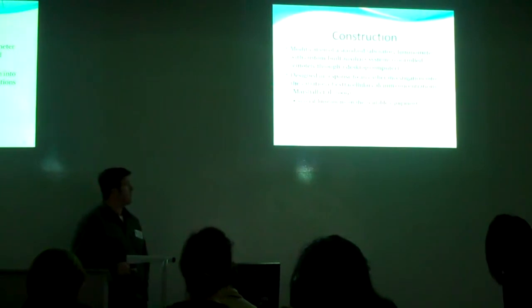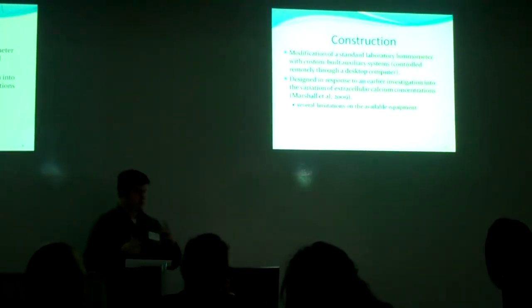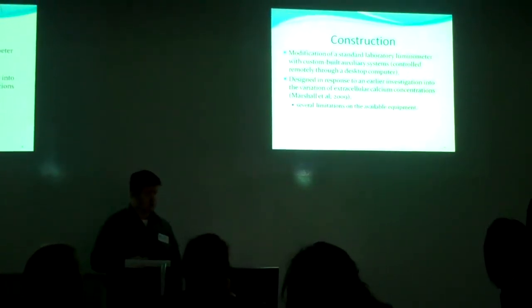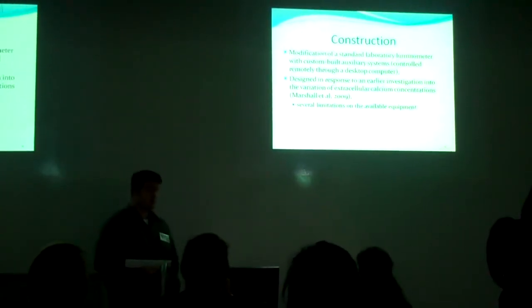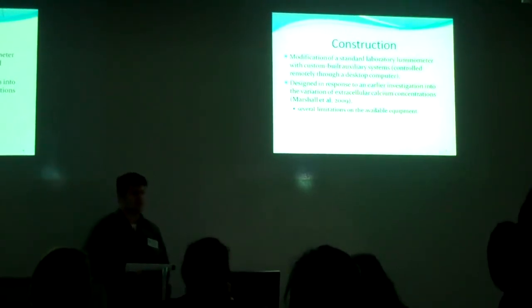out. The construction involved taking a standard laboratory luminometer and changing it with custom auxiliary systems, such as the pumping system, which we control remotely through a desktop computer. It was designed in response to an earlier investigation into calcium concentrations that met with several limitations on the available equipment.